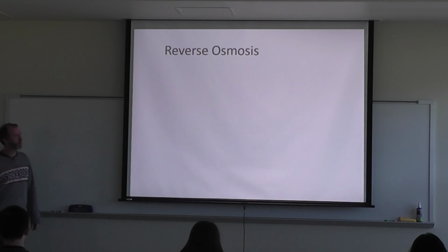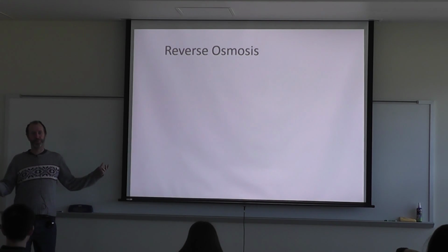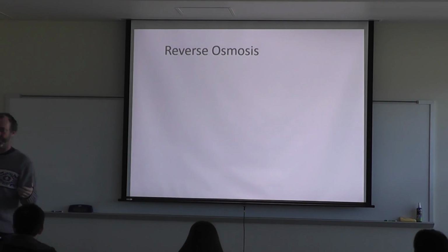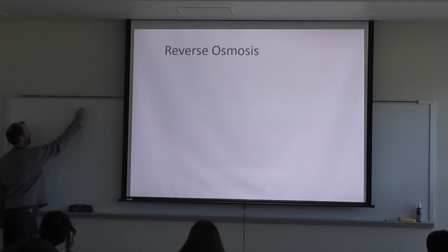Reverse osmosis. We've all heard of this. What is osmosis? Moving of water. Yeah, it moves across what? A semi-permeable membrane, and how does it move? By concentration level. You're wording it kind of funny, because it's the concentration of water that you're referring to.